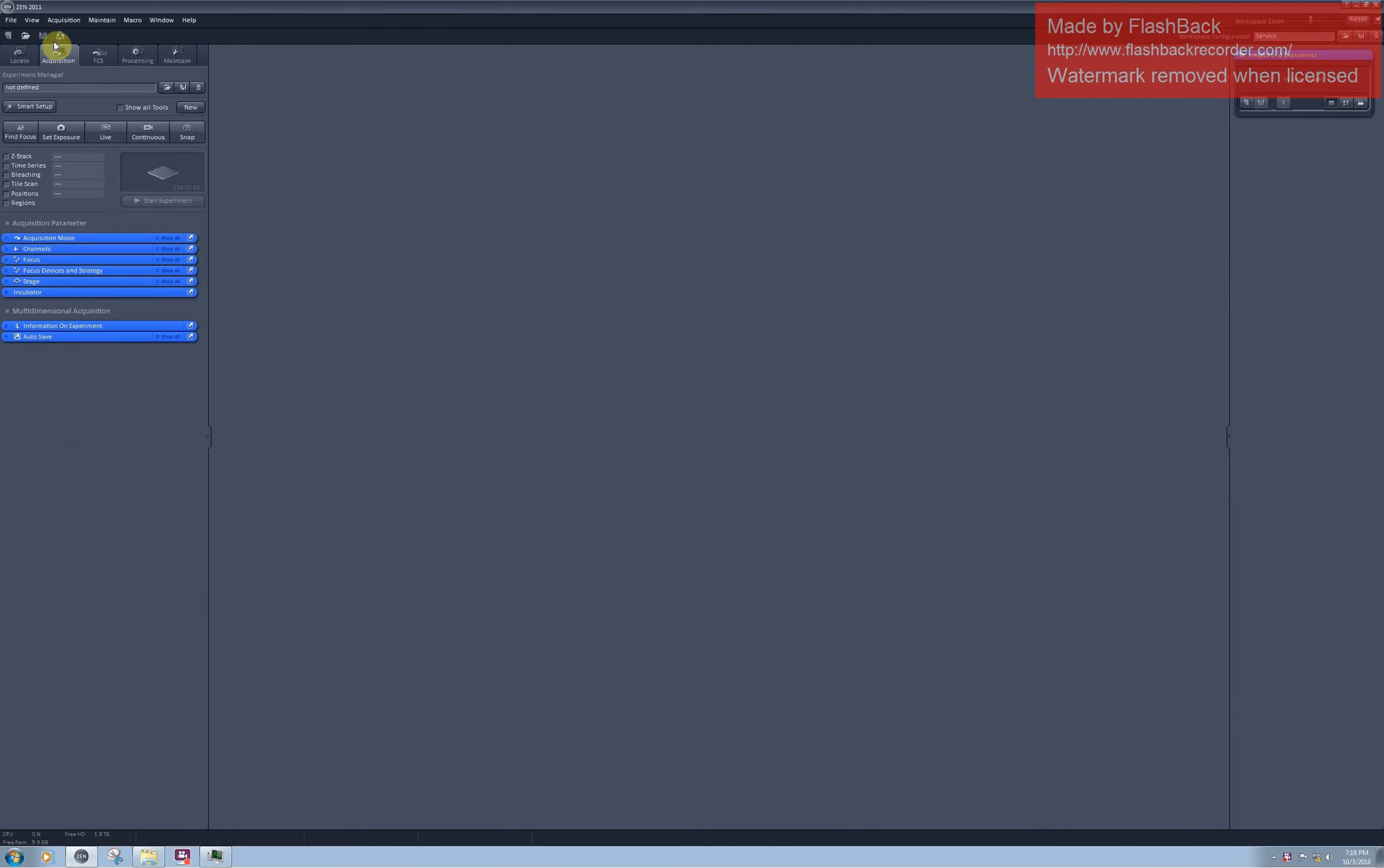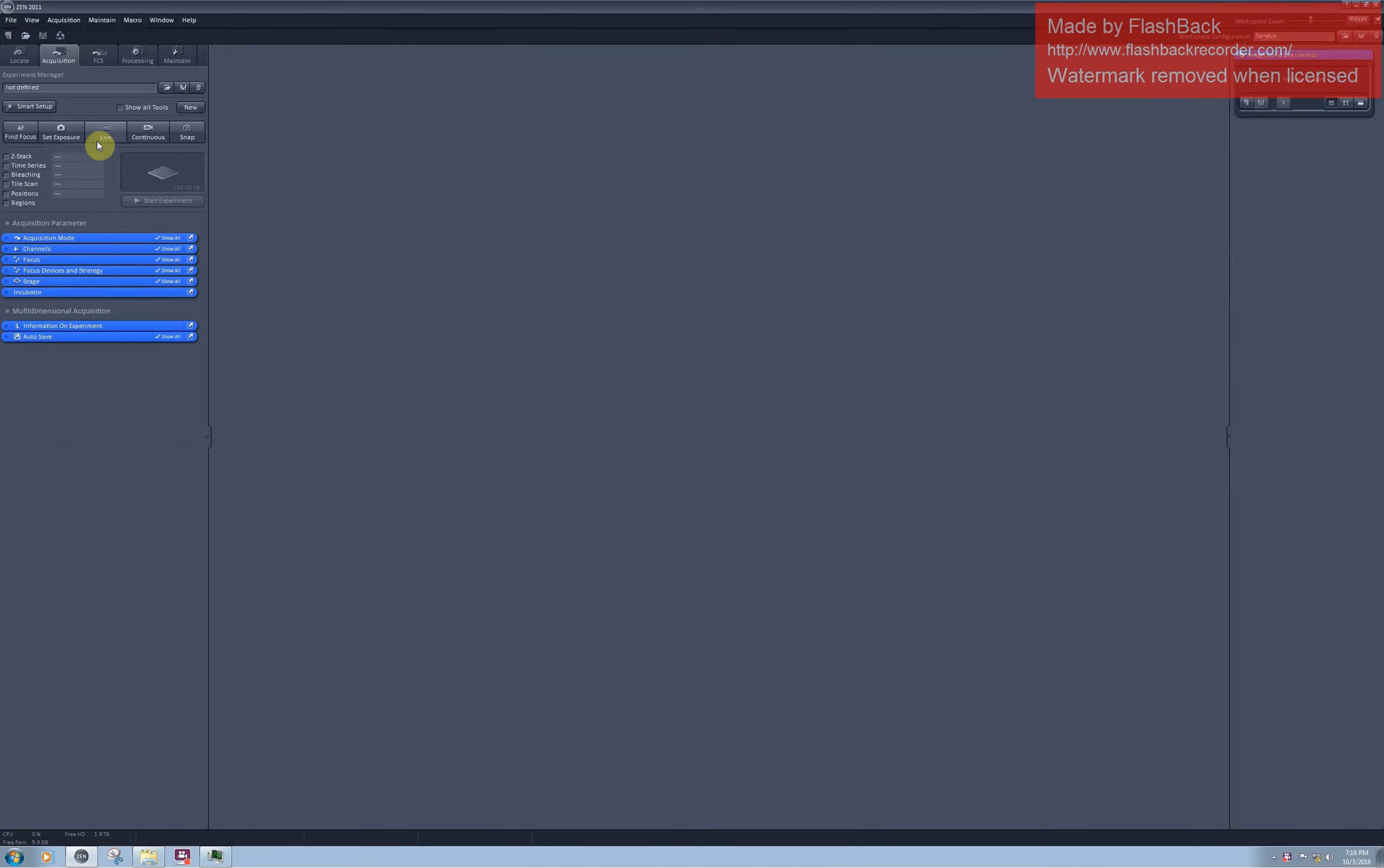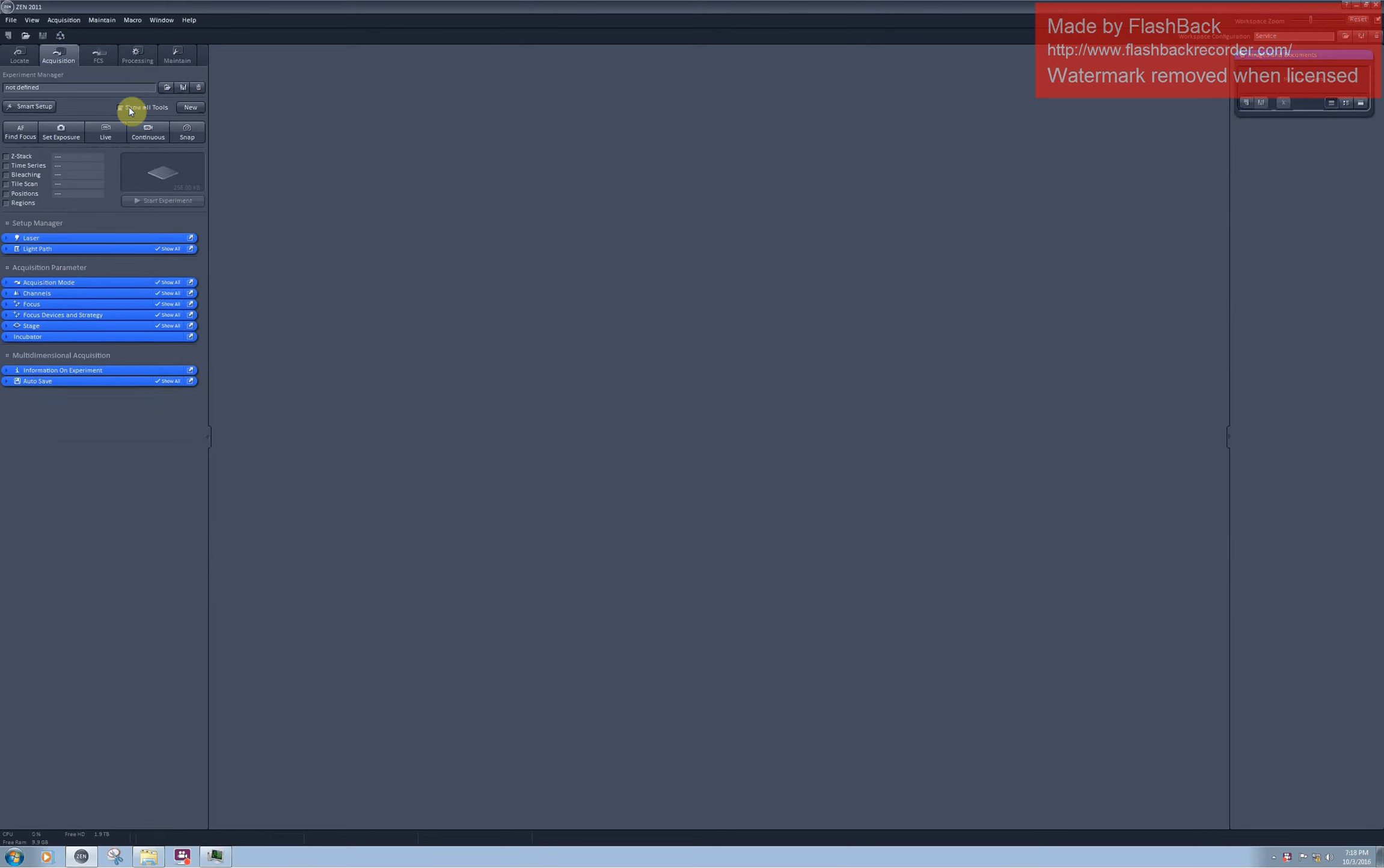Before you do anything else, I would highly advise you to go to the top menu and activate show all global options here, and also check in the show tools checkbox here. This will give you access to very useful extra settings in the software.